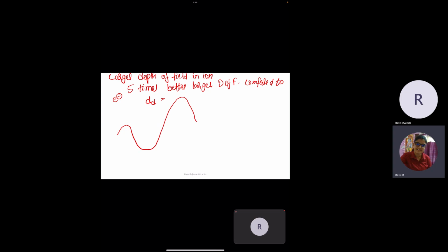having a higher depth, variation in depth, any fractured sample or anything, we will be able to focus this as well as this and as well as this in case of ion microscopy. In electron microscopy, if you are able to focus this, we will not be able to focus this one, if it is not falling within the range of depth of focus.